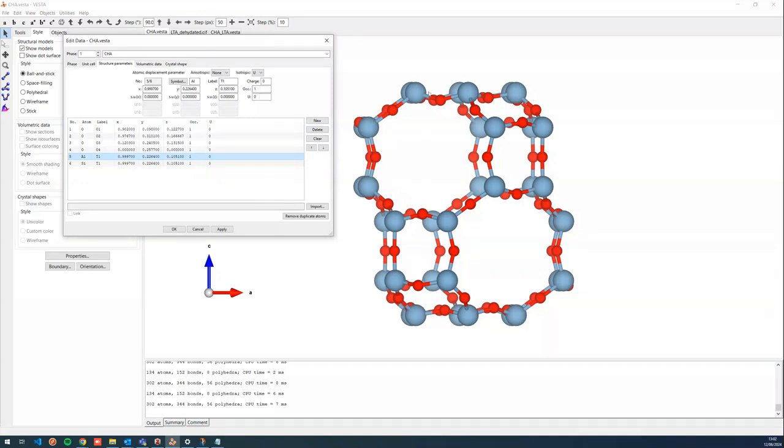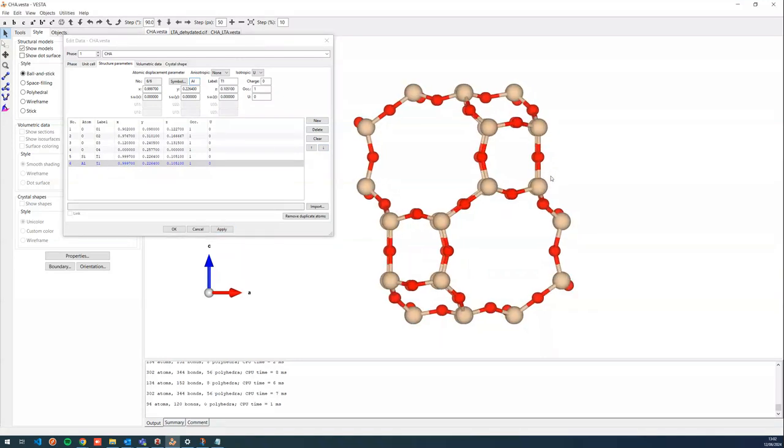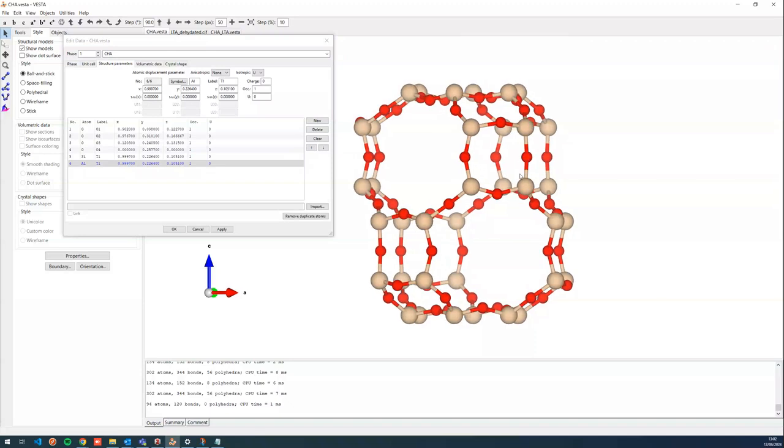Now, obviously, in the blue, only the aluminium is shown. If we would reverse the order so that silicium is first, you can only see the silicium. So this is not ideally what we want, because we might want to have a silica aluminium ratio.